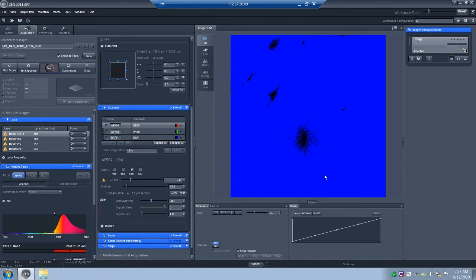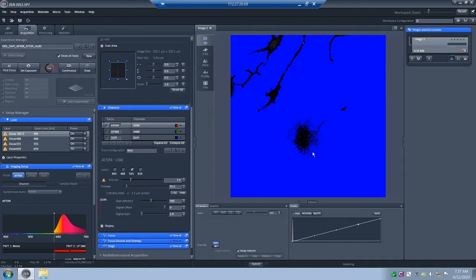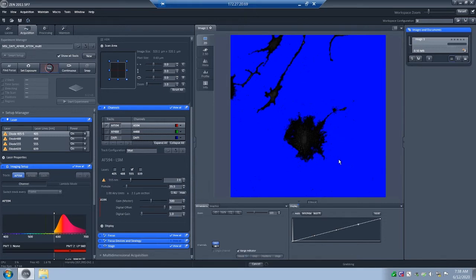There's some stuff here that looks like a cell. I'm going to move the focus knob manually to find the Z-plane where things look the brightest. Once I'm in the brightest Z-plane, I want to get rid of any blue pixels — those mean I could lose signal because the levels are too low for the detector. I'll increase the digital offset one unit at a time until all the blue pixels are gone.